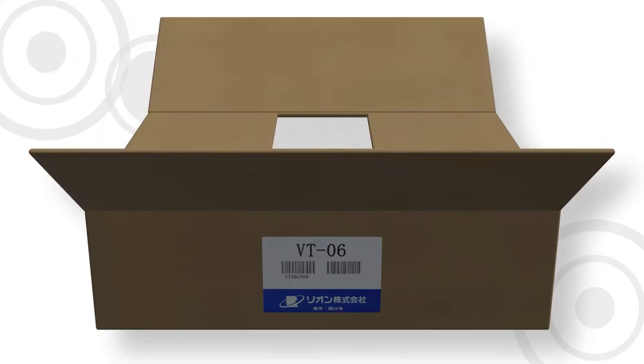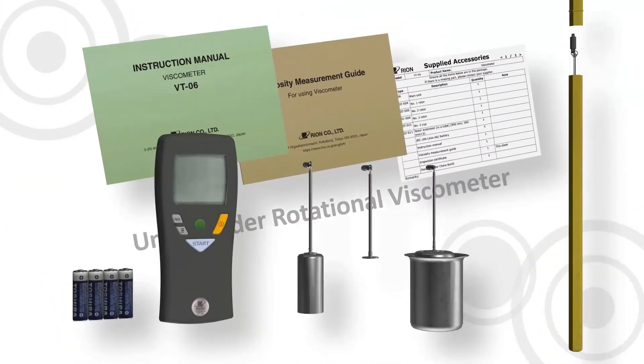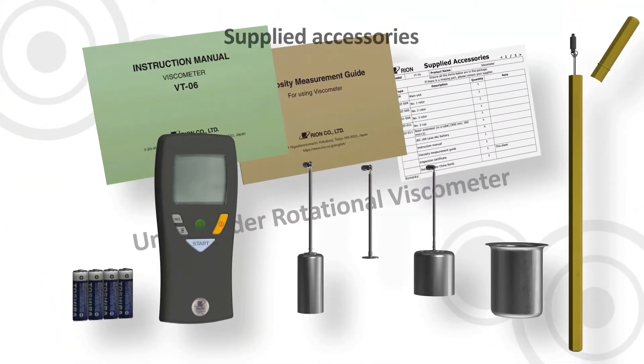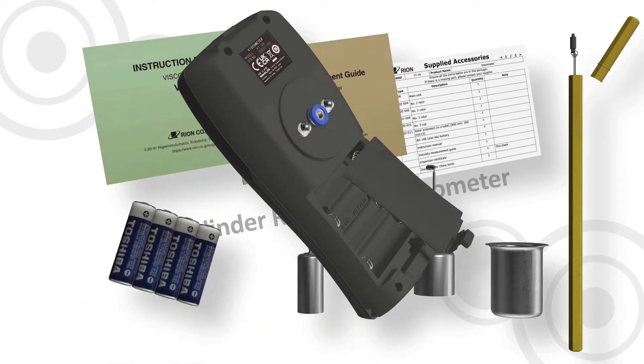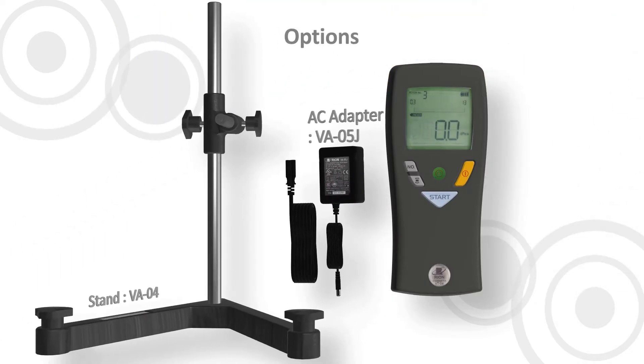The VT-06 viscometer. Uni-cylinder rotational viscometer. These are the supplied accessories. Available options.